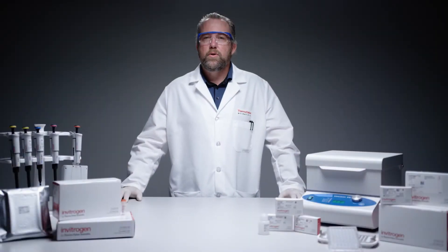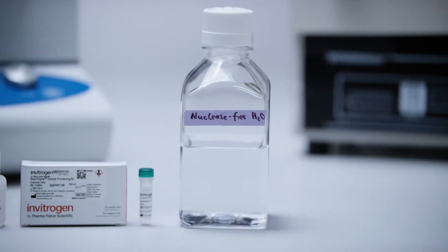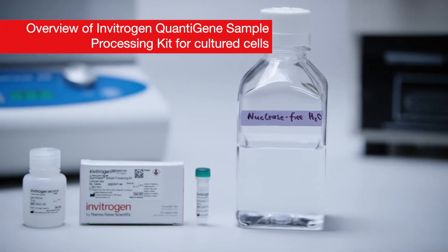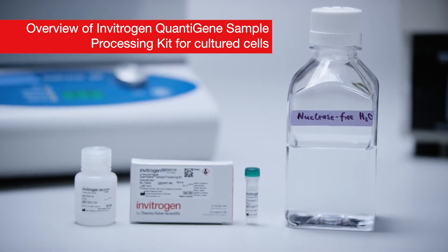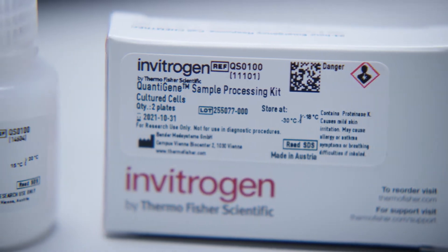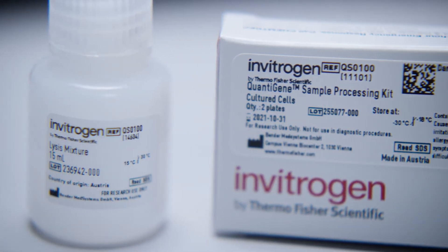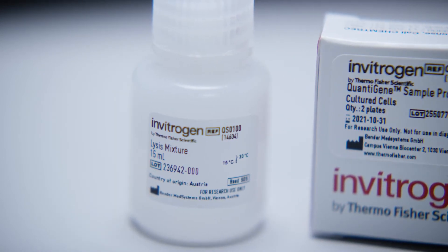In this video we will show you how to prepare and determine optimal sample inputs for any Invitrogen QuantiGene assay. The Invitrogen QuantiGene sample processing kits are designed for use with the QuantiGene singleplex assay for quantification of RNA or DNA targets, or for the QuantiGene Plex assay for quantification of RNA targets. The sample processing kit for cultured cells consists of concentrated lysis mixture and proteinase K.